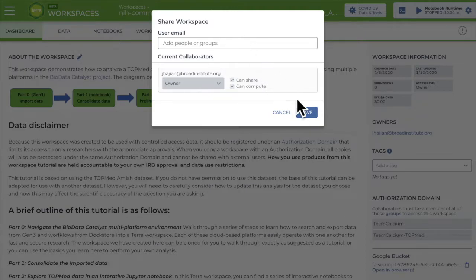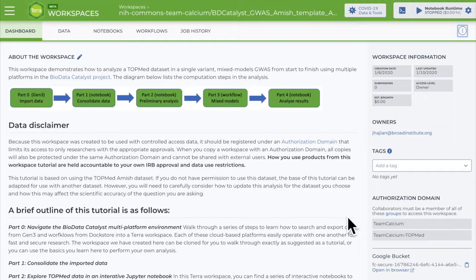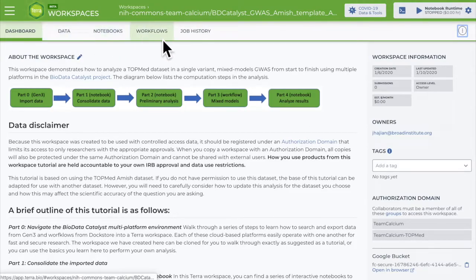Terra uses authorization domains to control who can work with restricted access data. Although you can technically add people who don't have the required authorization in this form, they won't actually be able to access the workspace. Instead, they'll get a warning message that they are not authorized when they try to open the workspace. Once you've shared the workspace, your collaborators will have access to all the project data, tools, and results at the level you specified.